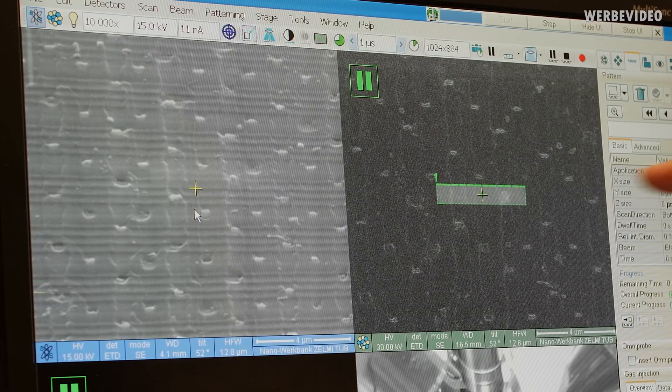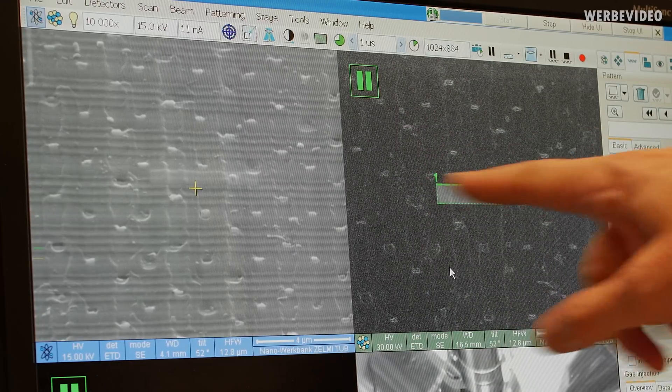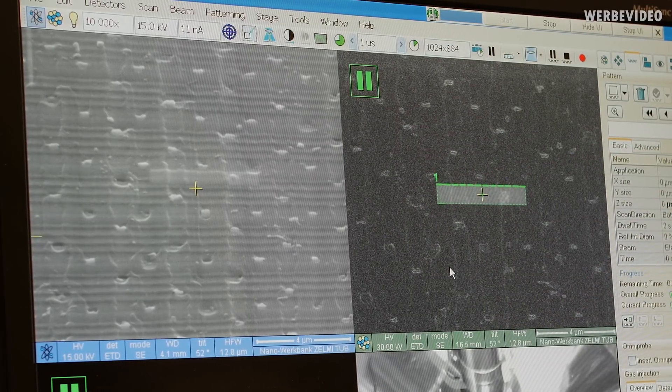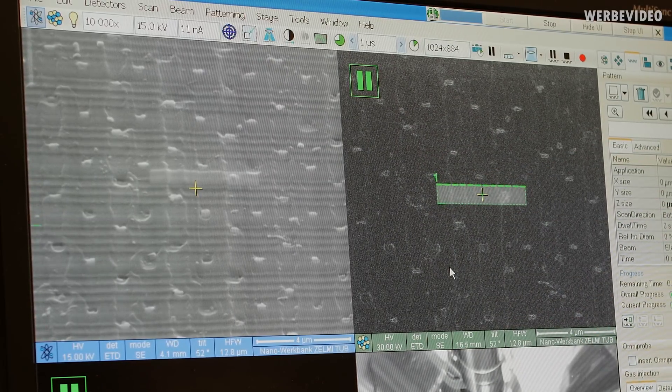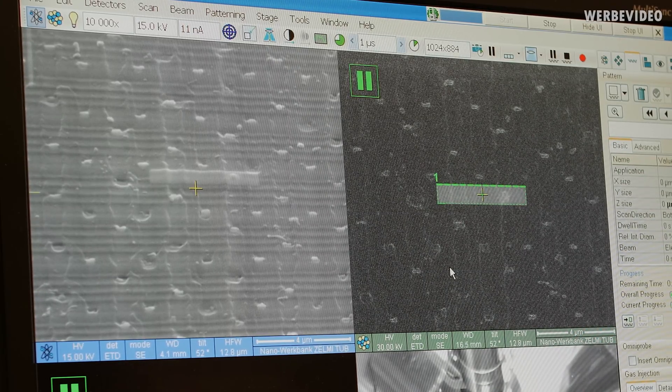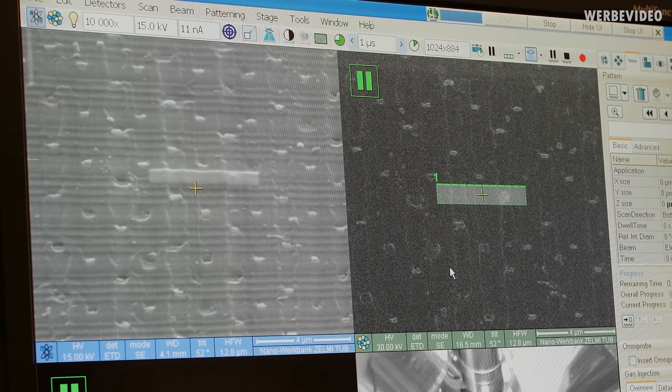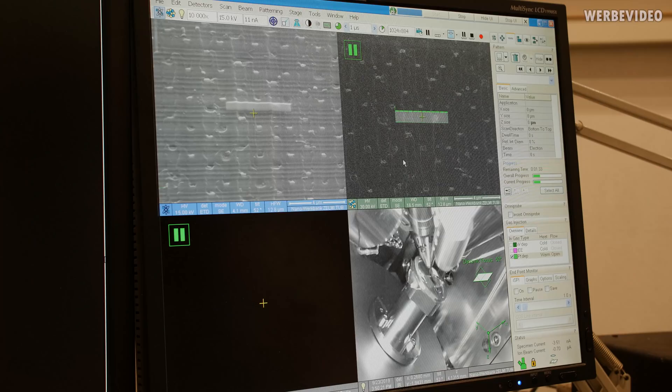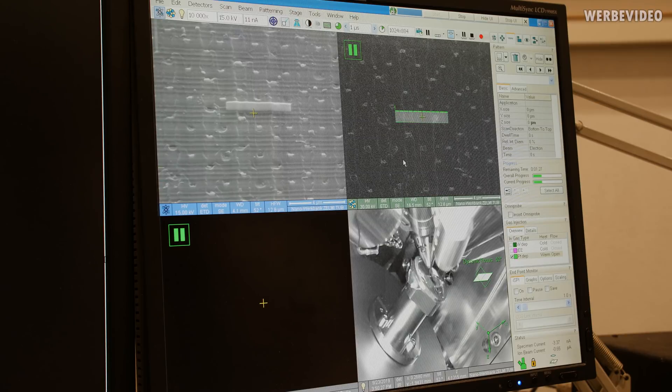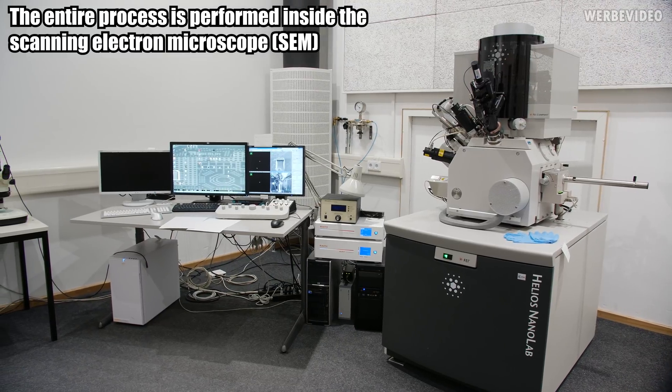And we can have a look on it with the SEM. And so what is now happening? We have this area here. And the ion beam is scanning along this area for several times. And at the same time, we have some gas molecules inside of the vacuum chamber. And these gas molecules, they contain platinum. And the molecules are cracked. And as you can see here, by time, we will have a deposition of platinum layer on top of the surface. So the gray bar we can see building up on the top left is the platinum. This is the platinum protection layer.